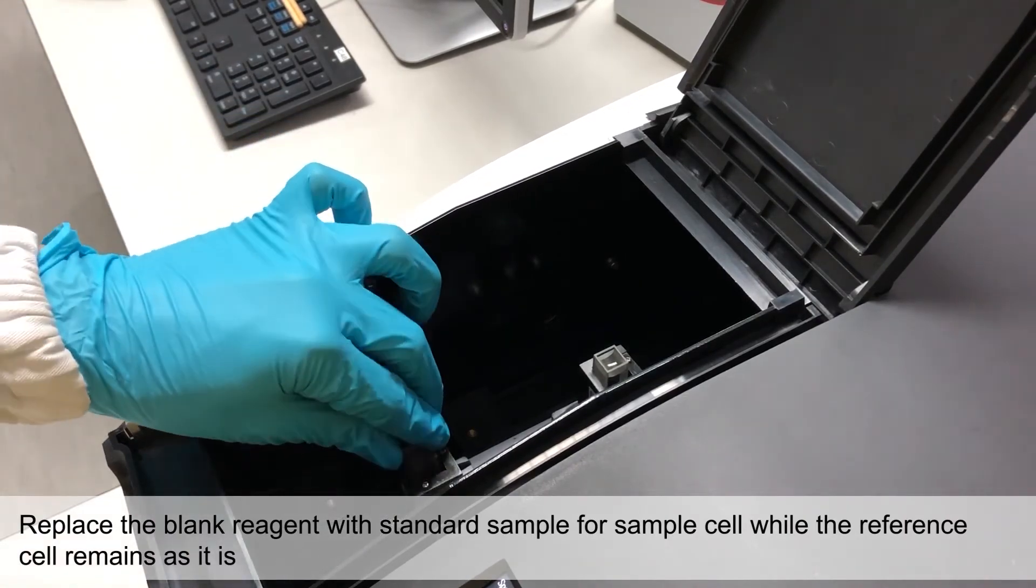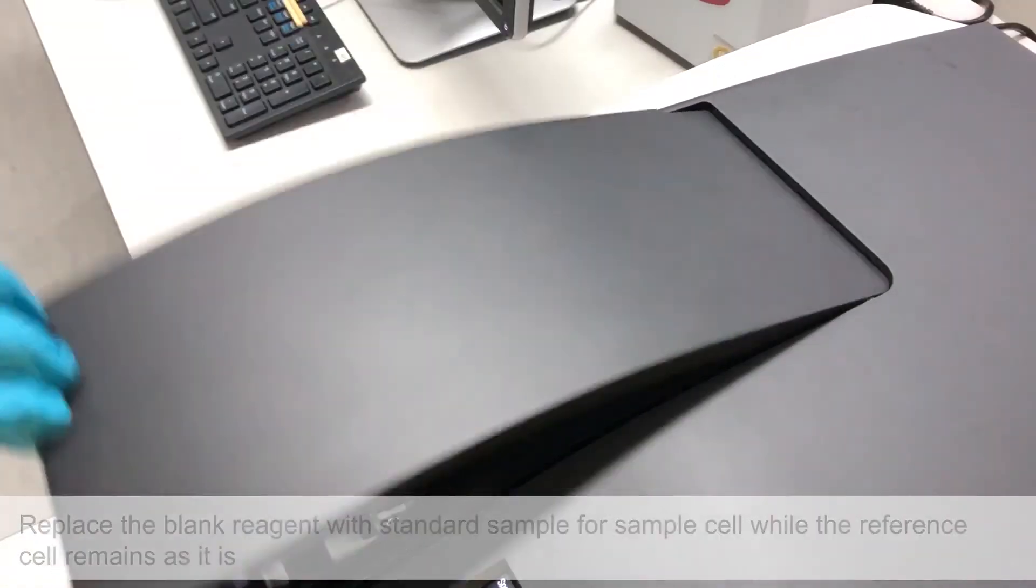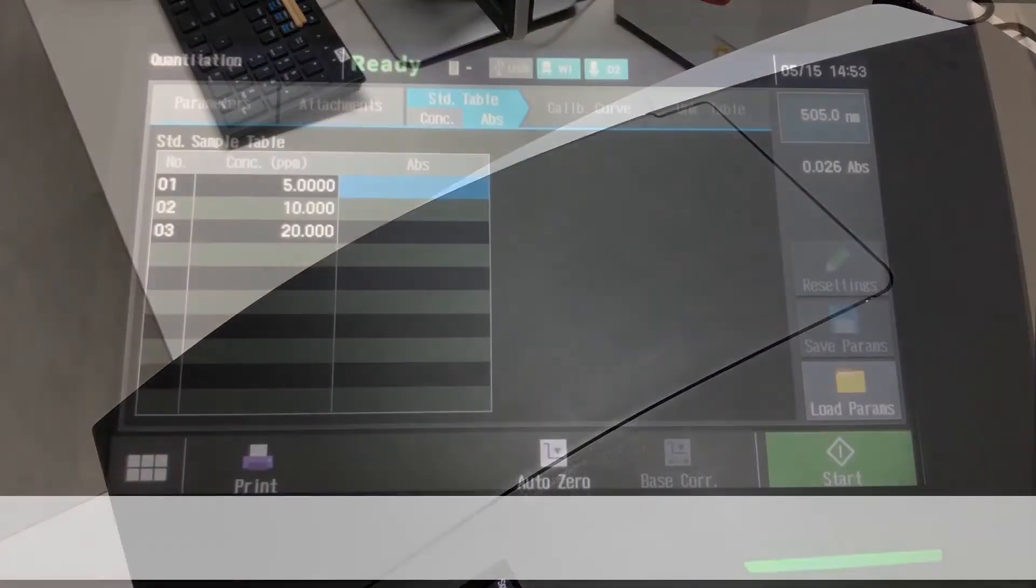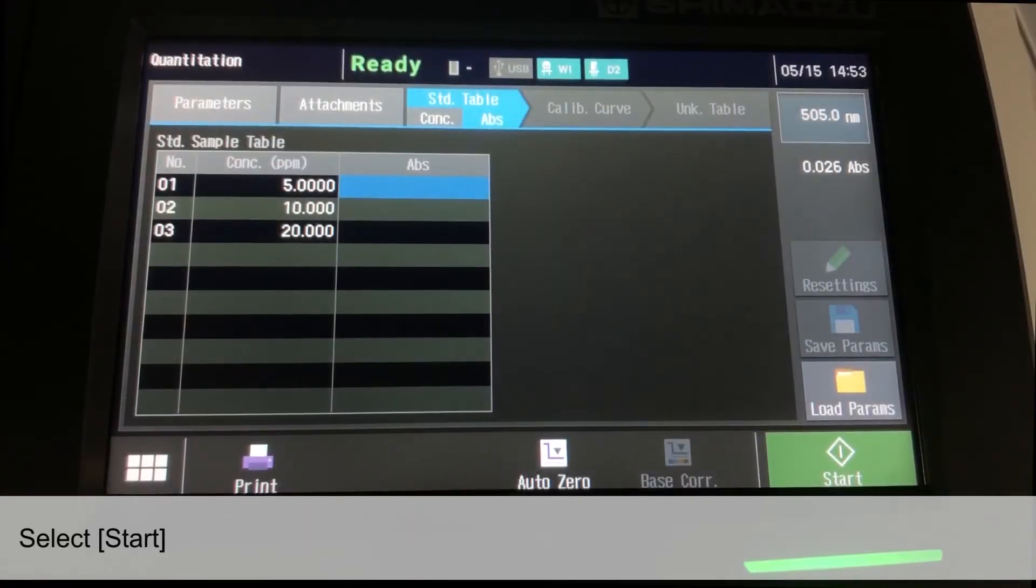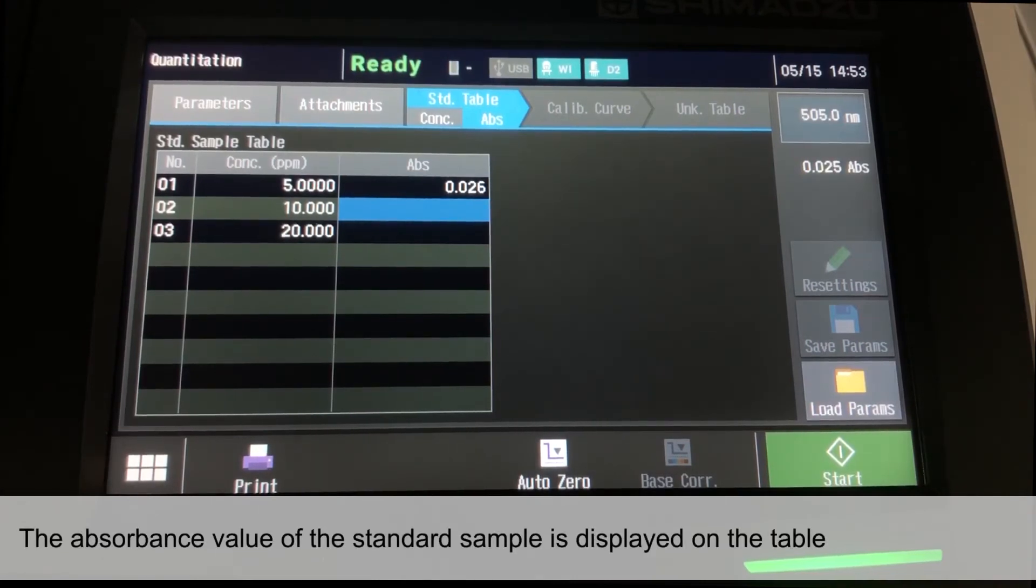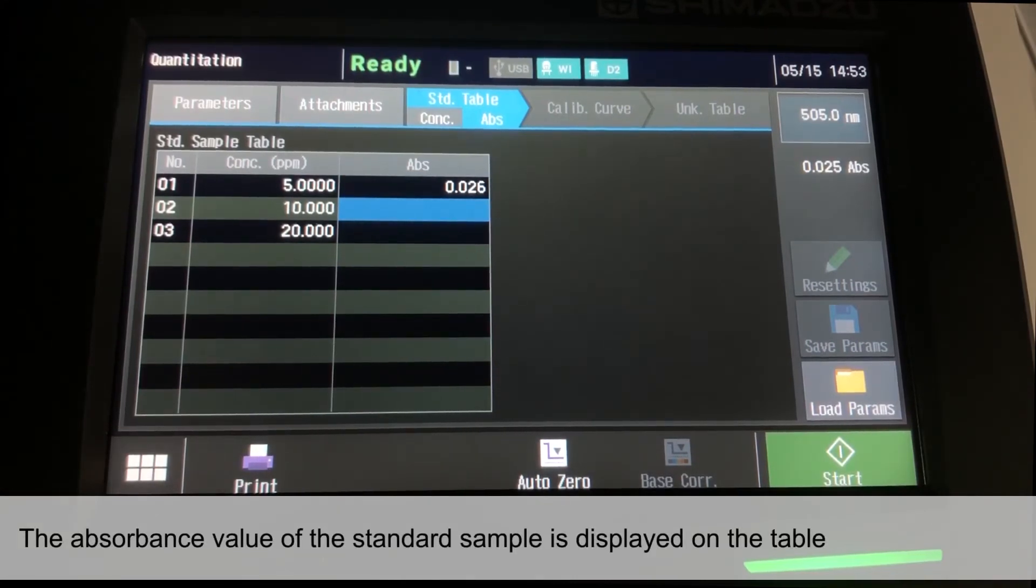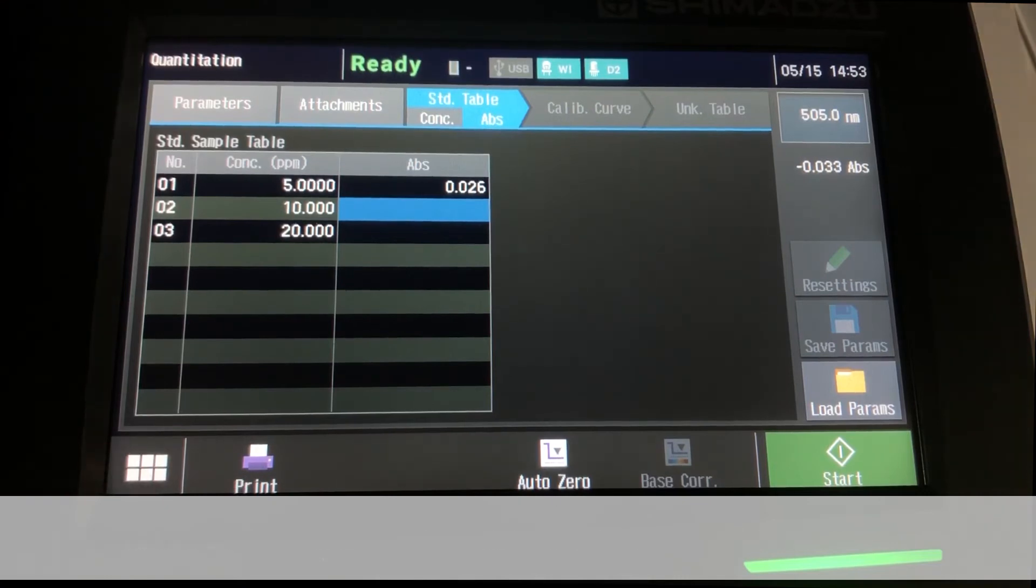The cuvette in the reference cell remains as it is. Select Start to measure the first Standard Sample. The absorbance value of the Standard Sample is displayed on the Standard Table. Measure the remaining Standard Samples.